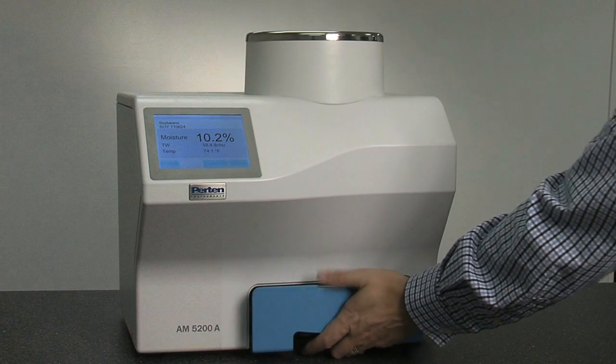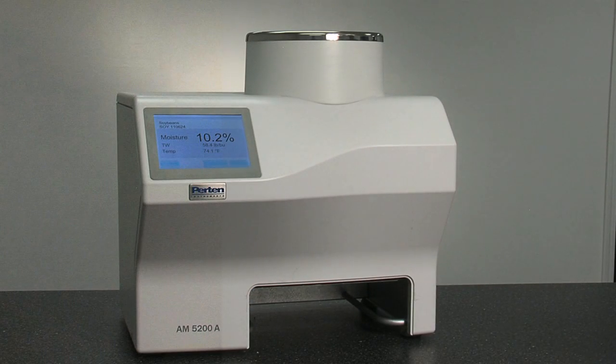To ensure a perfect sample volume, three brushes remove excess grain, which is directed into the collection drawer. This keeps the interior clean of grain and dust.